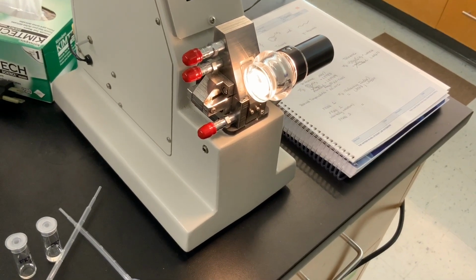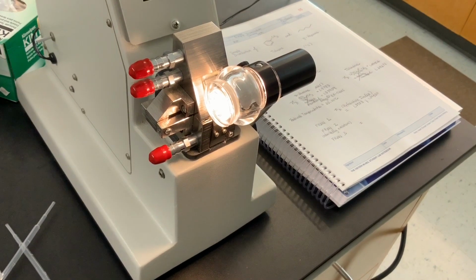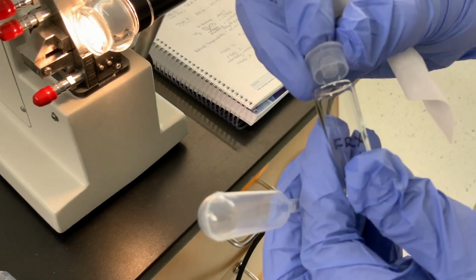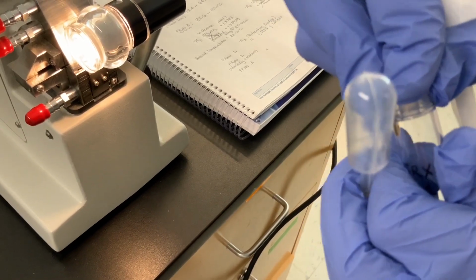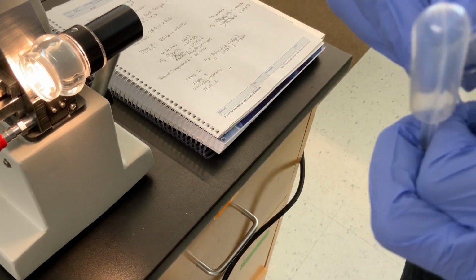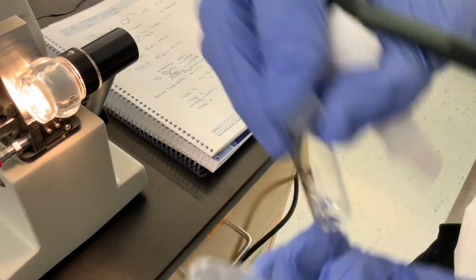So we know that fraction 2, we're admitting ahead of time that fraction 2, also look at this sample vial cap, just so you're aware, the hexanes has sort of dissolved the plastic and the snap cap isn't able to go on anymore. But good thing we've already got those.